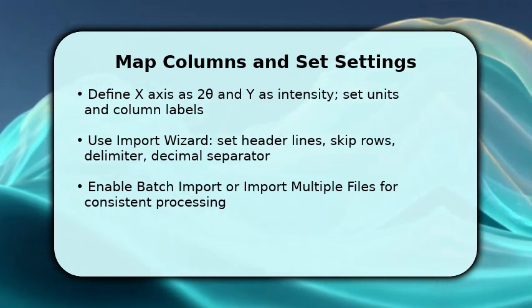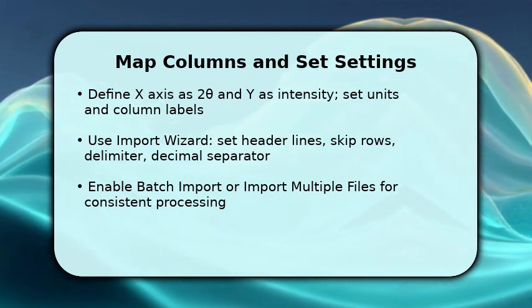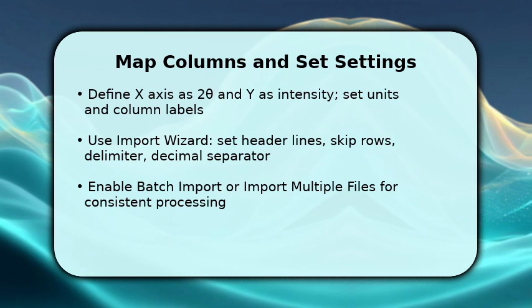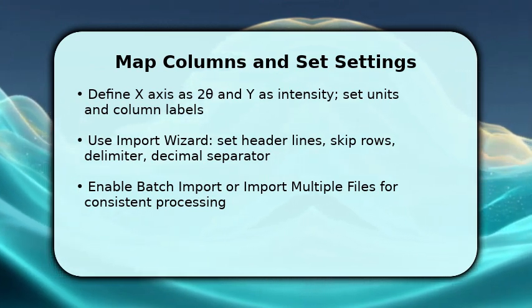If multiple files share the same format, enable batch import or import multiple files to apply the same mapping automatically. This saves time and preserves consistency, which is crucial for comparative analyses and automated peak fitting.